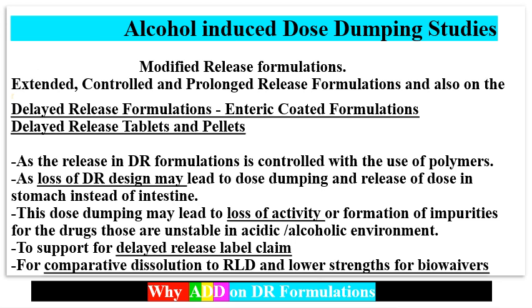So to support a delayed release label claim, an alcohol dose dumping study is required. Also, alcohol induced dose dumping studies are required for comparative dissolution of the test or generic product along with the RLD, and for supporting data for lower strengths for biowaivers. So delayed release formulations are required to be studied for alcohol induced dose dumping.